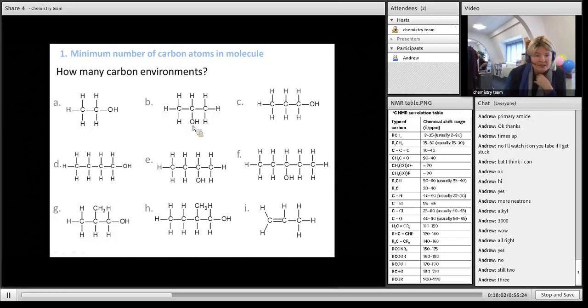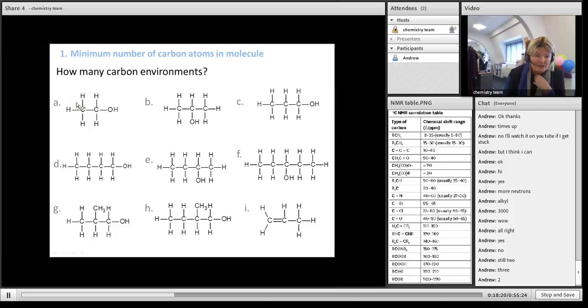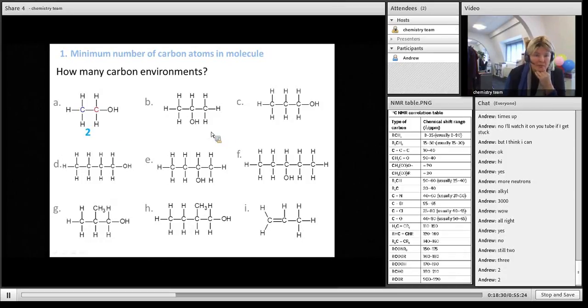Okay, so let's have a quick quiz. Now here, just look very carefully. I have put OH in, so these aren't just hydrogens. So think of what the carbon is attached to. This one is 3 hydrogens and a hydroxymethyl. This one has got an OH, 2 hydrogens and a methyl. Will it be the same? So it's got 2 peaks, correct.